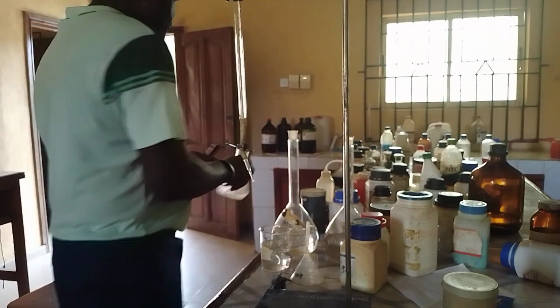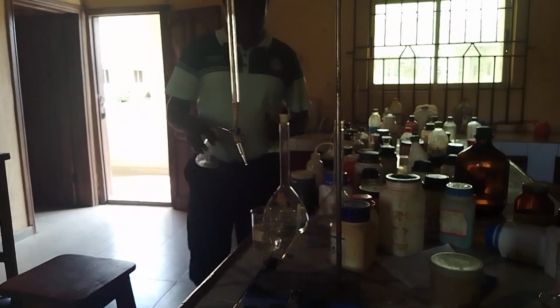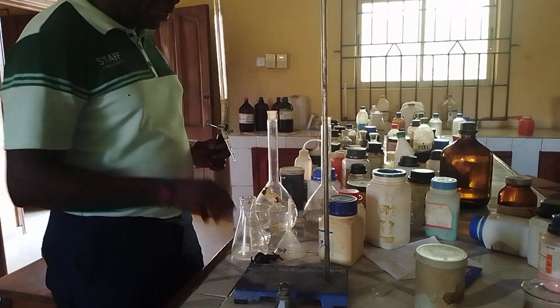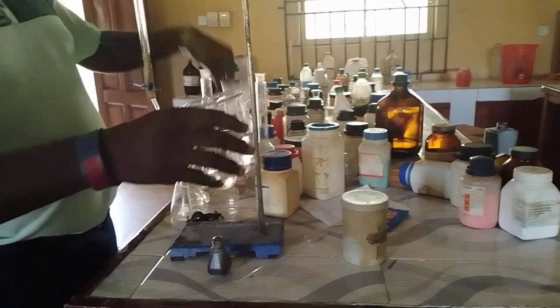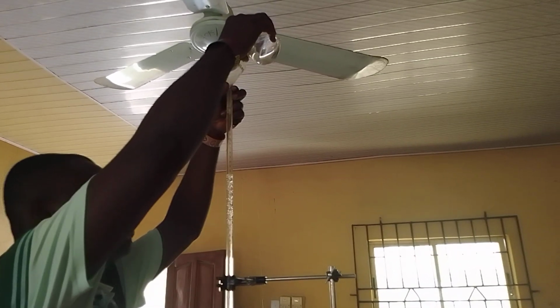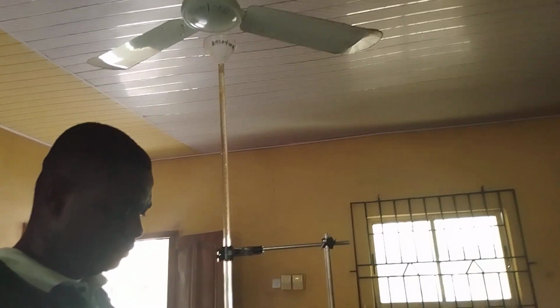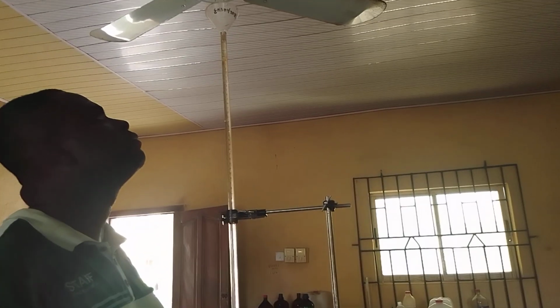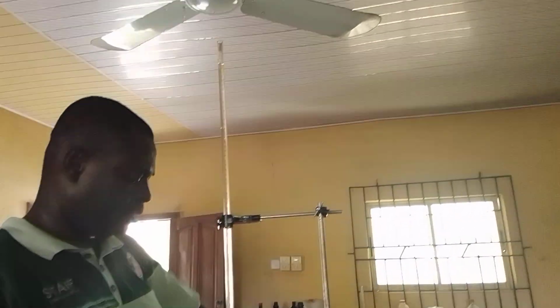So I will rinse here with the B that I was using for before. Then I will fill up the burettes with A again. I'll remove the burettes.